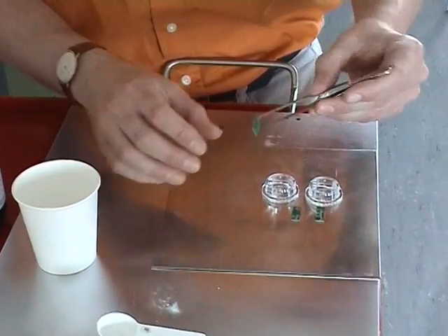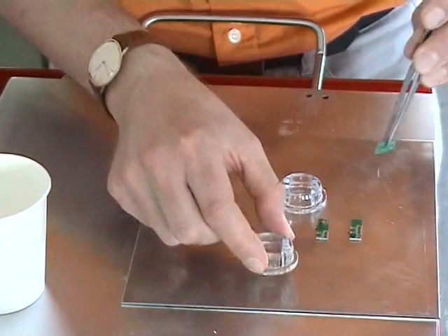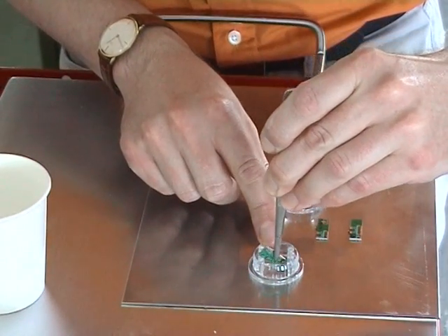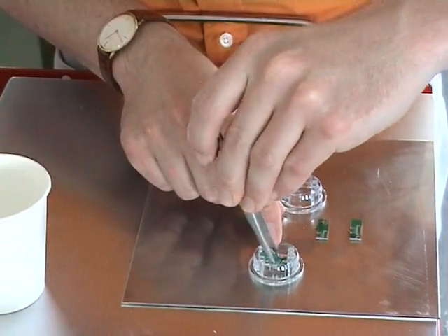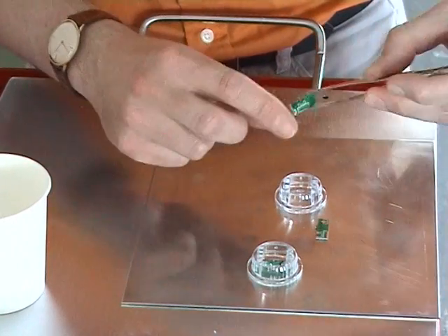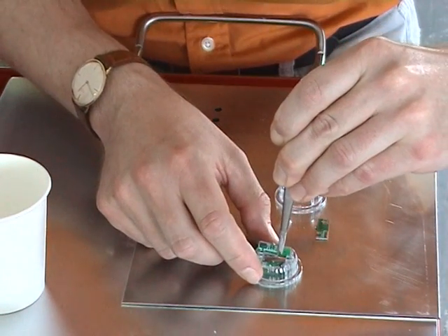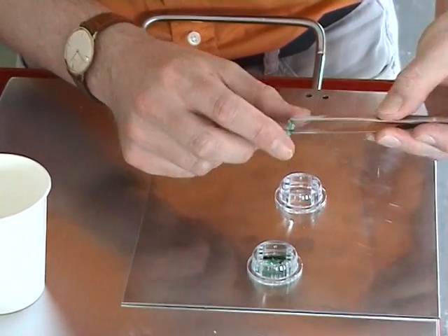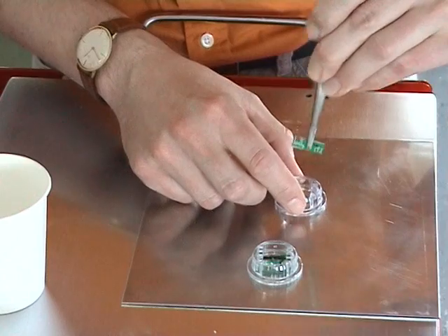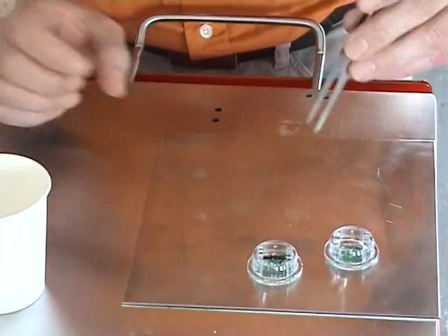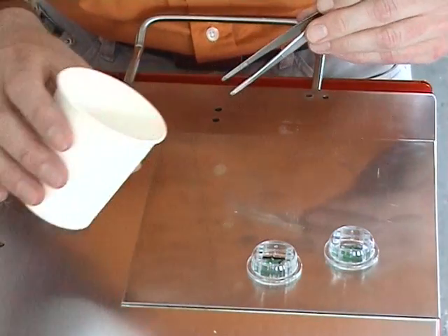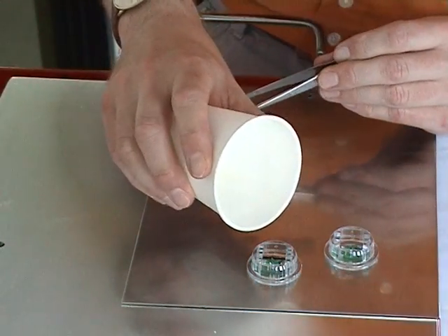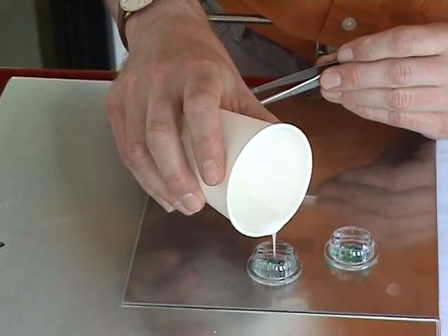Choose the appropriate specimen holder depending on the specimen thickness. Up to four specimens can be put in one holder. Fill in the liquid carefully so that the specimen is embedded.